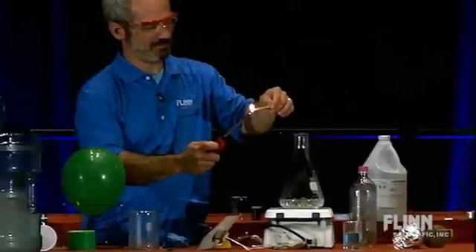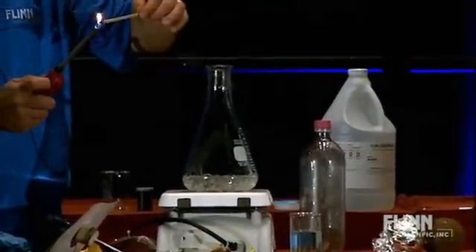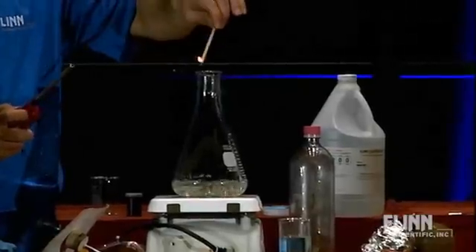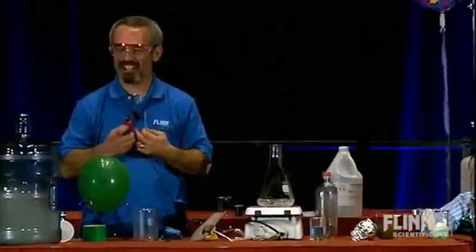I'm going to take this wood splint and here we go. Not even close — it puts it right out. Why not? Well, apparently the oxygen in there is already spoken for. It's already bonded to the hydrogen.